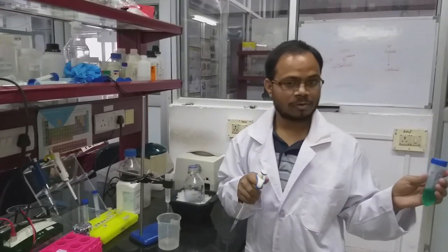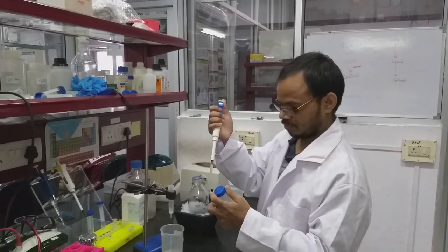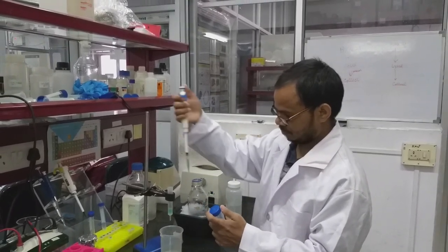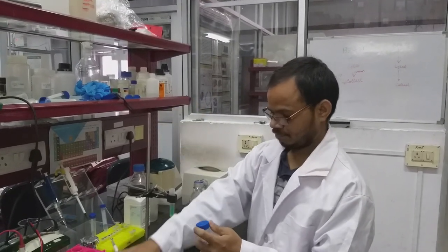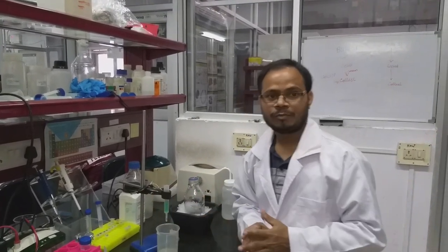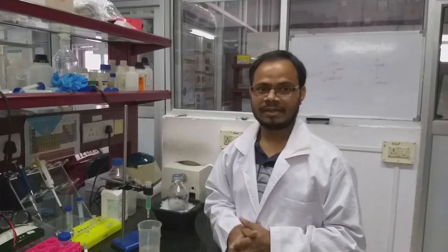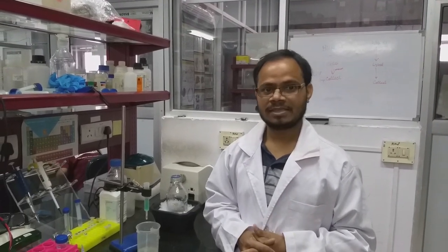So this is a nickel chloride solution. We will keep it in this condition for at least 20 minutes to charge the beads. After that we will remove the nickel solution, and then I will equilibrate with the lysis buffer.